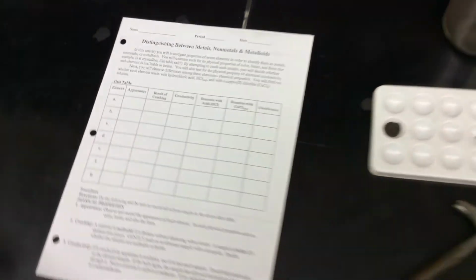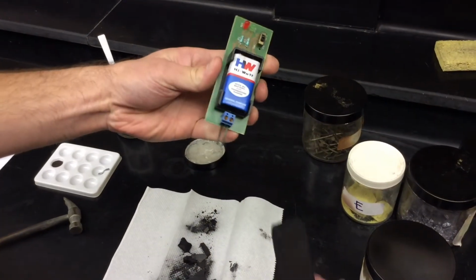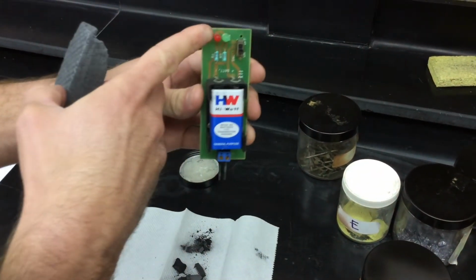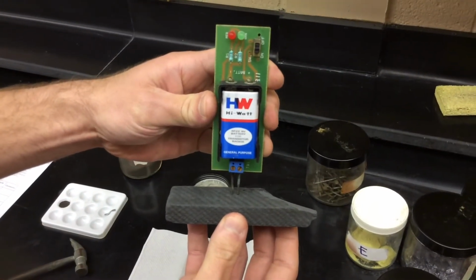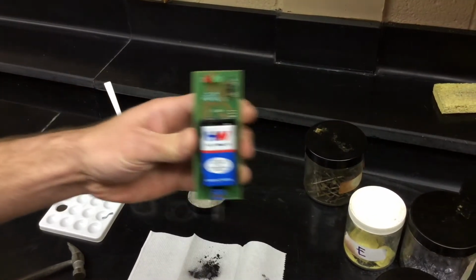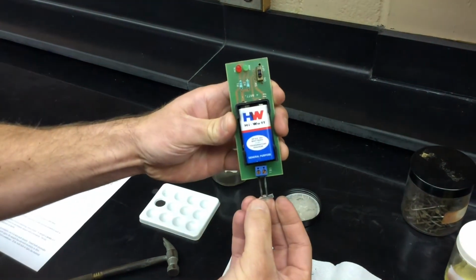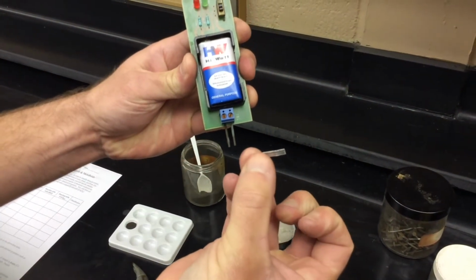The next one is conductivity. And this is another one that might be done as a demo because we don't have too many conductivity testers around. So what you would do is turn that on, and for example, if you touch it to a piece like this, this is an open circuit, so the light is not lighting up. If something conducts electricity, it closes the circuit and this light would light up. So for this sample, this is not causing that light to light up, so this would be a non-conductor. Where if you have something like this, and you touch it to those 2 prongs, that light is lighting up very bright. So this one conducts electricity. That is a conductor.